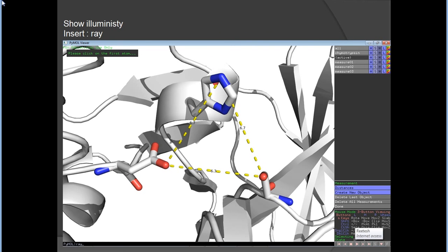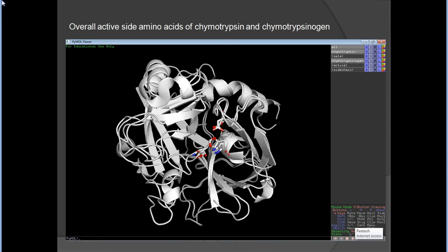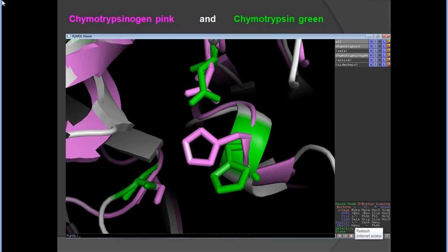Distances are displayed in angstroms. For a better view, type 'ray' or 'ray 1000, 2000' to get higher resolution. These are the overall active site amino acids of chymotrypsinogen and chymotrypsin. For better presentation, chymotrypsinogen is shown in pink and chymotrypsin in green.